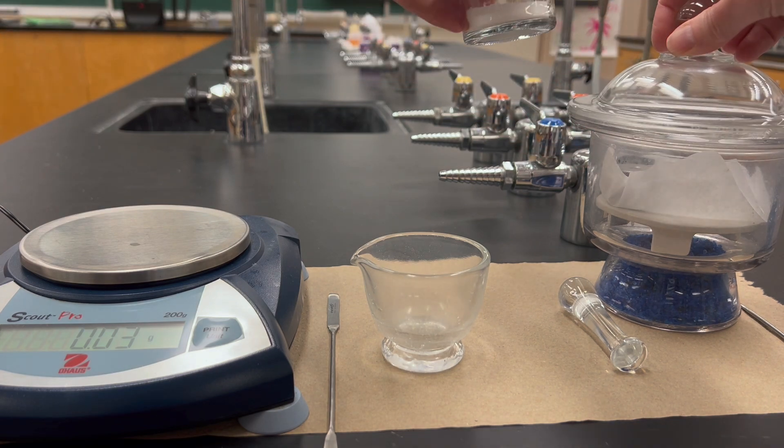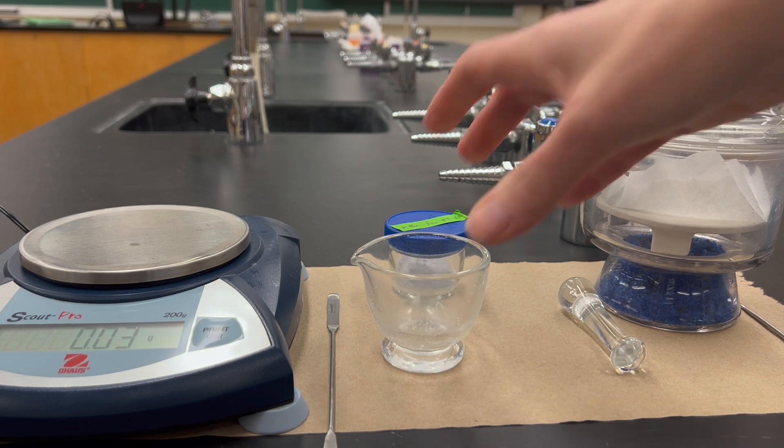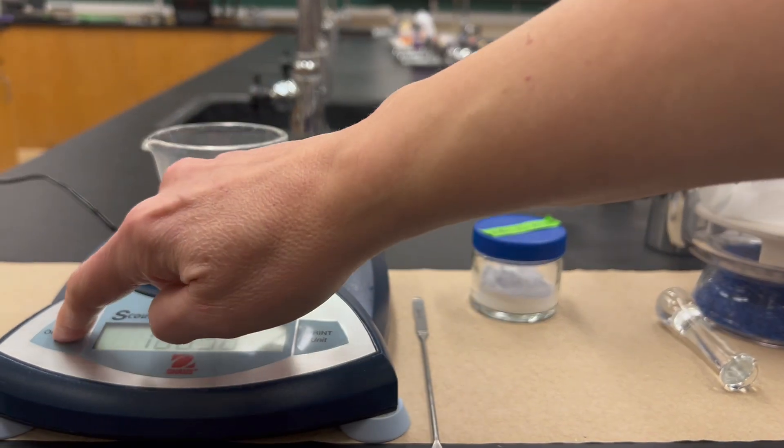Next, you want to get the KBR solid. We normally keep this in a desiccator because it's highly hygroscopic—it absorbs water from the air.